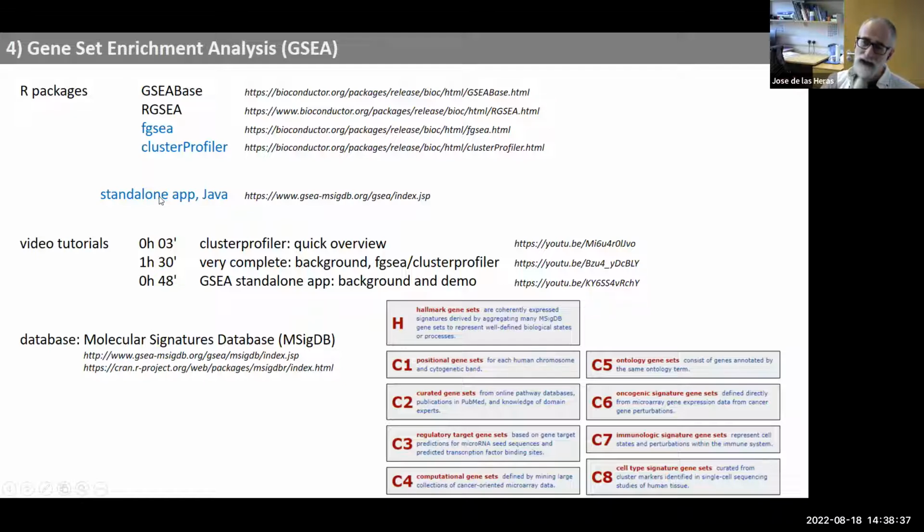And what I like about this, similar to the gProfiler standalone, is that once you have your input files ready, you can dump them there, press the button, go away, and then you come back and you have a folder full of files. And then you can spend a lot of time going through all these files. This is what I'm going to show you briefly now.